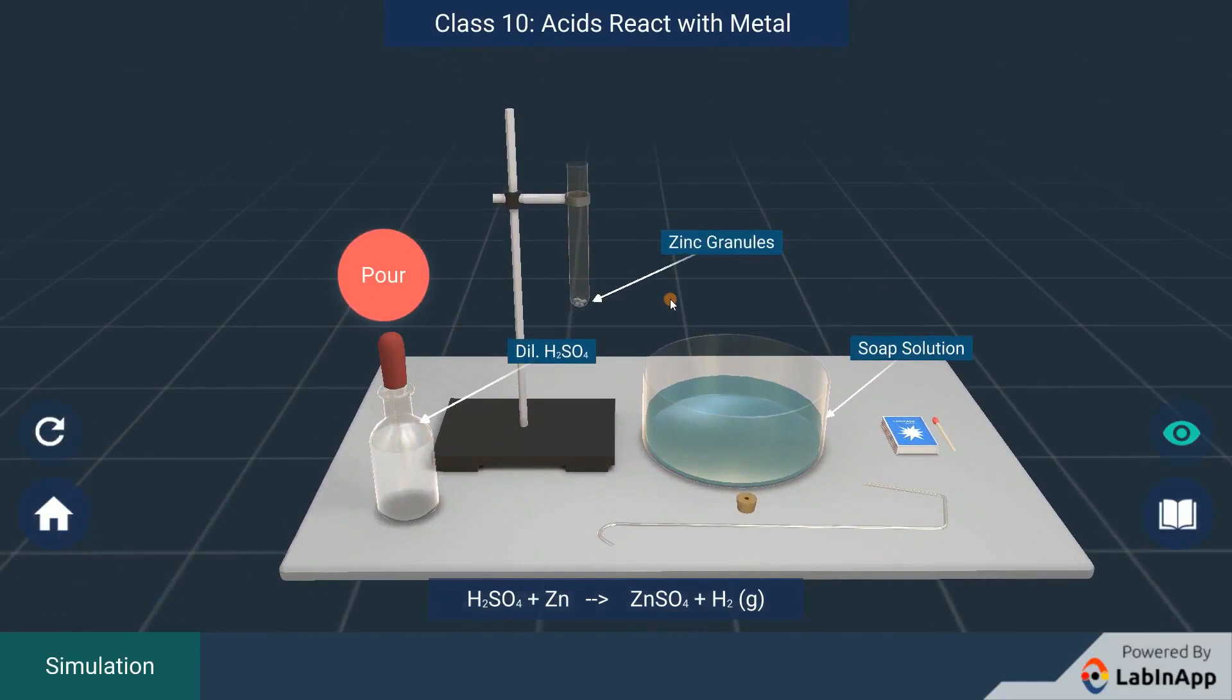Add dilute sulfuric acid to a test tube containing zinc granules and observe.